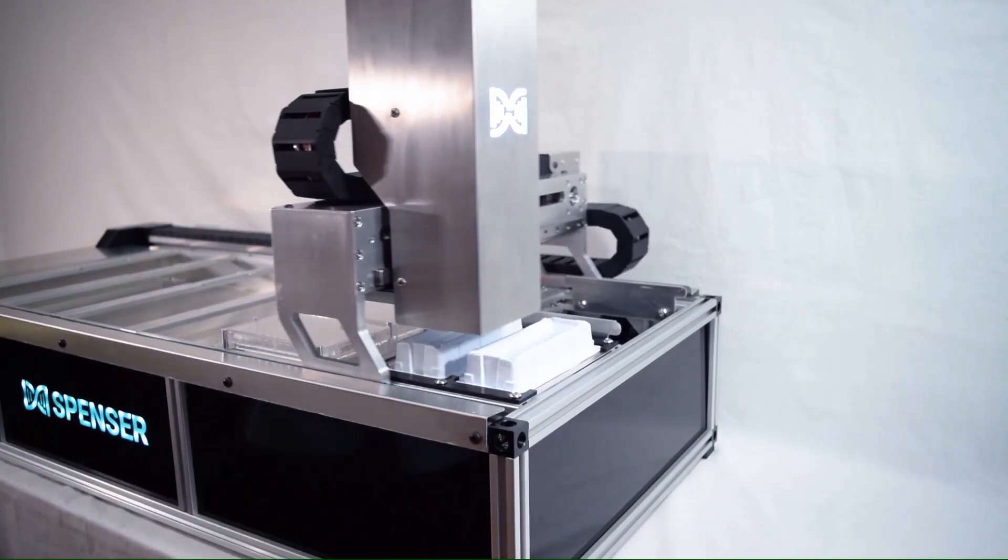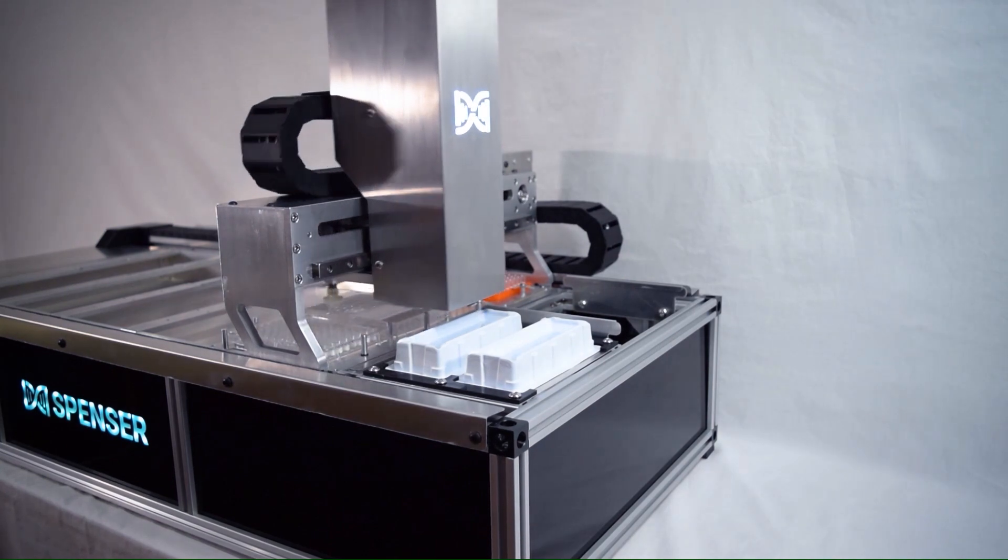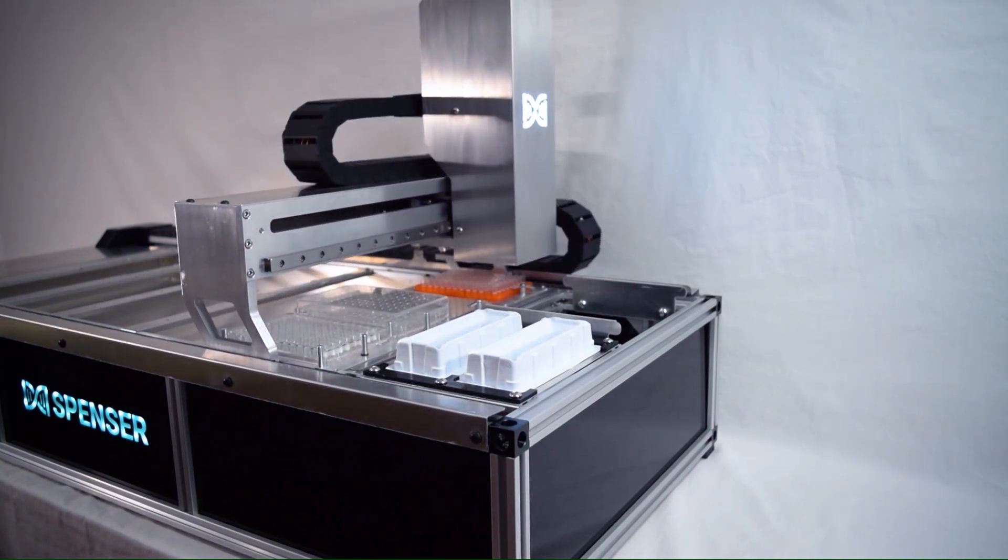The primary movements of the machine are achieved via a three axis gantry style motion system. Here you can see the machine performing a full seeding operation.